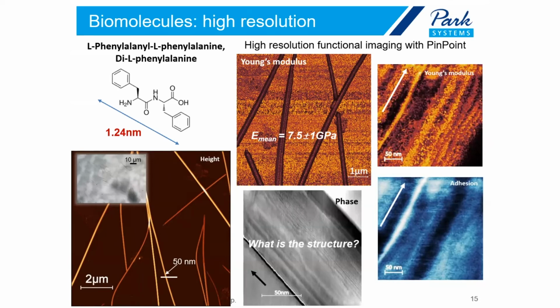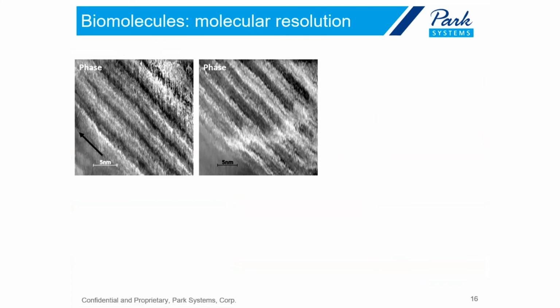So, yeah, the main question: what is the structure now? When you zoom further and you take, I don't know, 20 or 25 nanometer images, and you can take those images along the tube, because remember the advantage of the AFM: not only is it real space, but it's very localized. So you can probe very small areas on your sample, or along the tube in this instance.